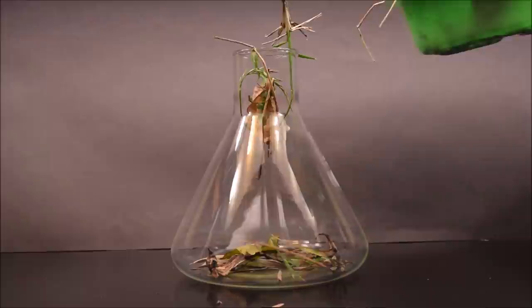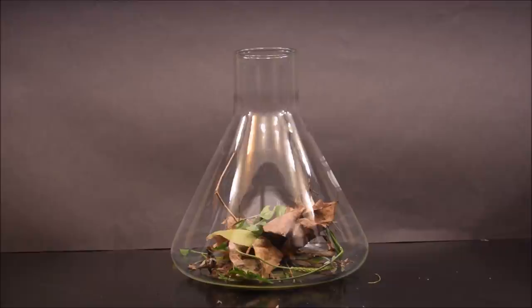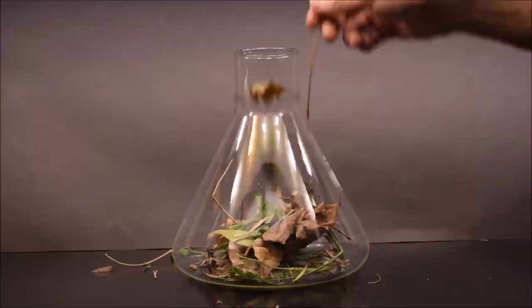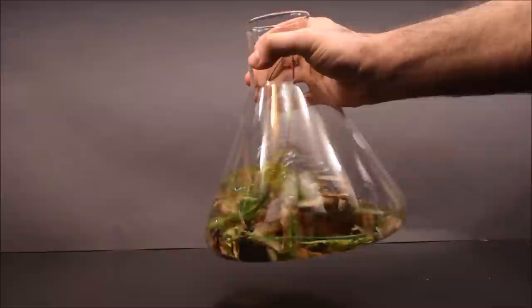Putting leaves and grass in water provides food for bacteria, and larger protozoa eat the bacteria and multiply. One of the most common questions I get from these types of videos is: where do the microbes come from? The answer is they come from the leaves and grass that I put in, as well as the air. Microbes are found everywhere, so all I'm doing is providing food, water, and a place for them to grow. This is also an easy way to get a diverse mix of microbes without having to go to a lake or river.